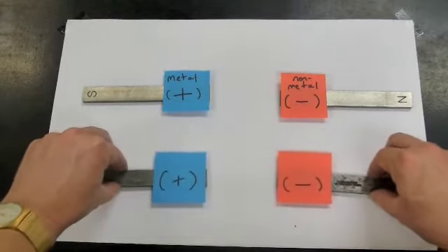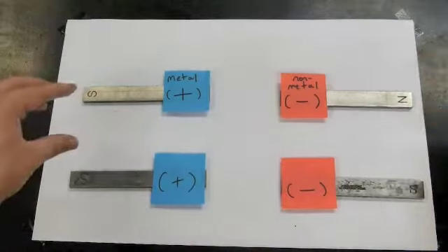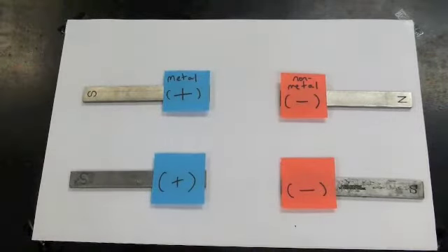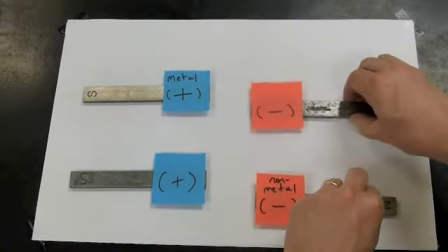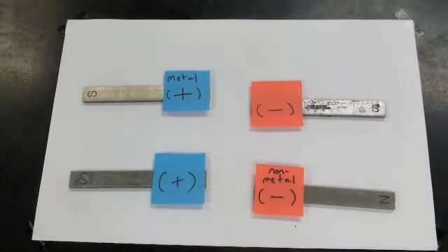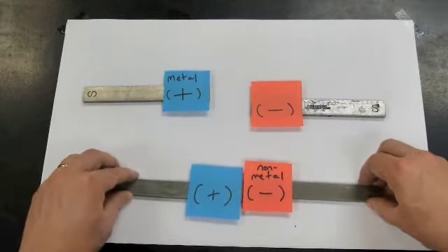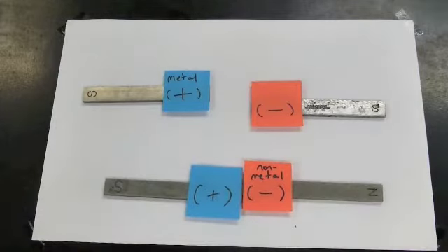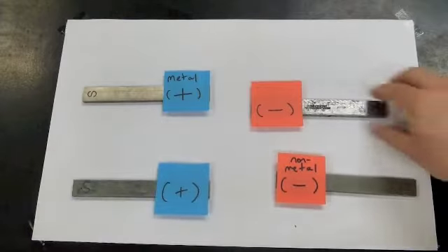When you take two different ionic compounds and put them in water, some of the ions will come apart and the substance will dissolve, and then they can rearrange who their partners are and form new combinations. Some of those combinations will stick together, and then they're no longer soluble, they no longer dissolve in the solution, and you can see them precipitate or snow like a white powder. And we'll look to see which combinations form new compounds.